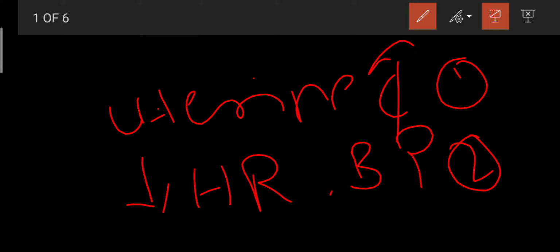Those parameters are considered for the bioidentity of any drug on the basis of pharmacological action. Oxytocin causes uterine muscle contraction. You take the standard drug oxytocin, give it to the uterus and note down whether the uterus contracts or not. If it contracts, it is okay. It is a standard drug, and oxytocin definitely contracts the uterine muscle.